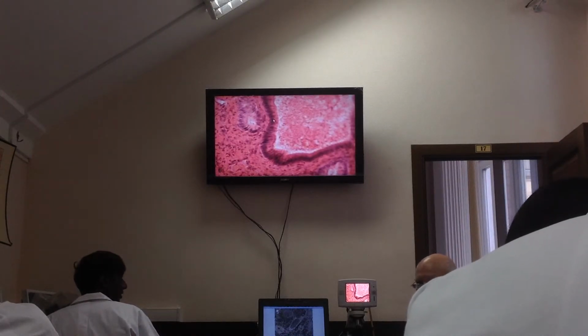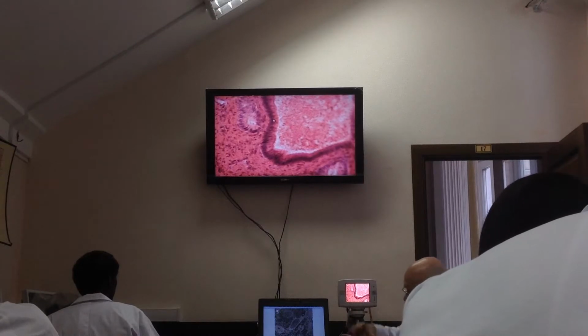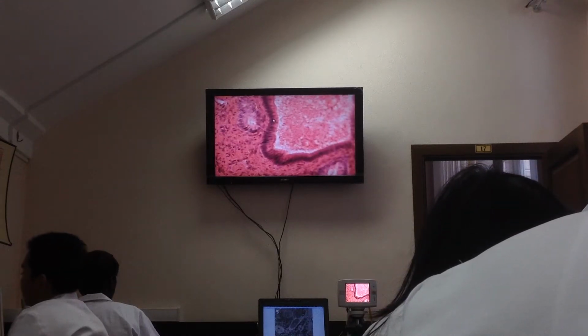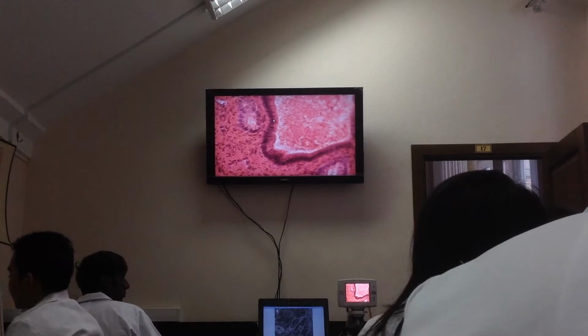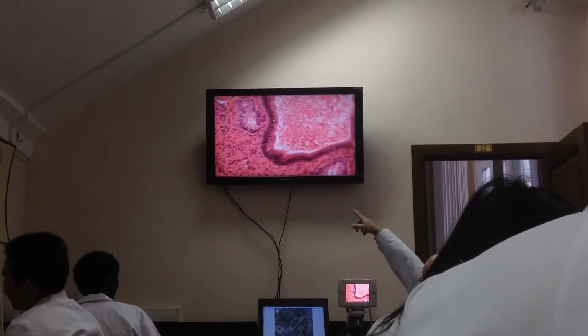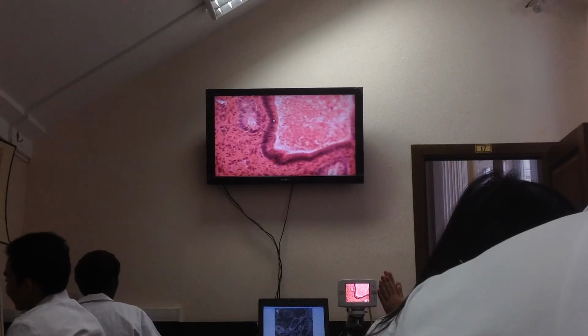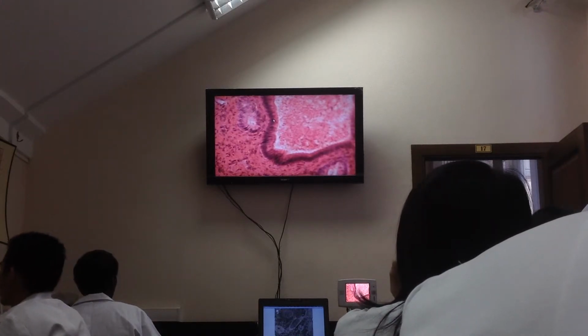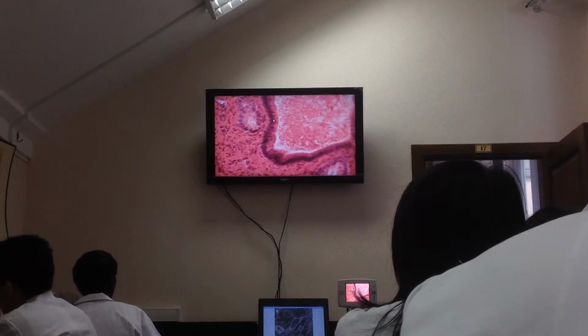There are epithelial, muscle, nervous, connective, bony, cartilage tissues. What tissue? Epithelium. It's epithelium. Hey, wake up, histologists. Look, it's a layer of cells, localized compactly, without intercellular matrix, forming a sheet of cells. Epithelium.